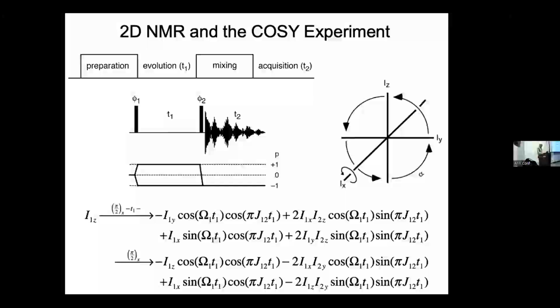So we can separate the in-phase operator from the antiphase operator by their different dependencies on T1. You would think we could just pick a few values of T1 and do some kind of least squares fitting of the sinusoids. That turns out to be pretty inconvenient. Fitting sinusoids is difficult because you can easily fit harmonics of them.